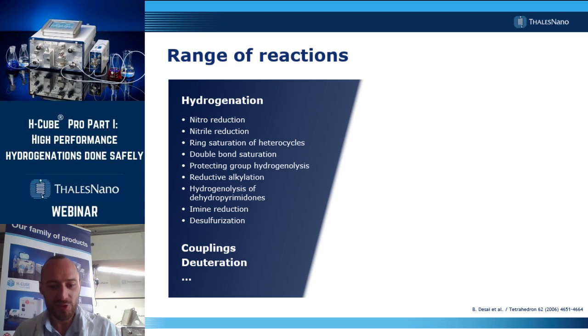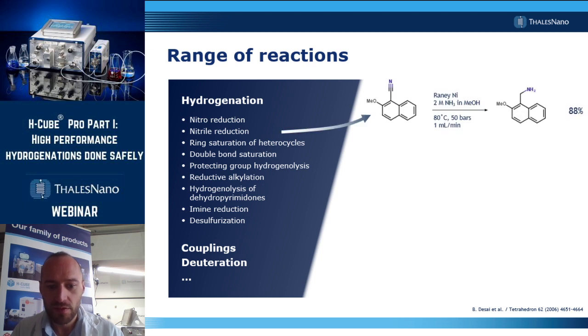Okay, let's now talk about chemistry. All the following reactions I'm going to show you in this slide and in the next slide have been done using H-Cube instruments. So I'm not going to detail all of the reactions, but I'm going to go into some of them. You can do different kinds of hydrogenation.